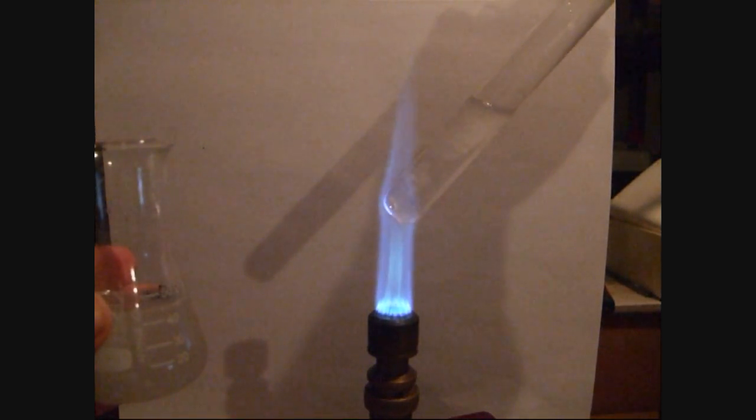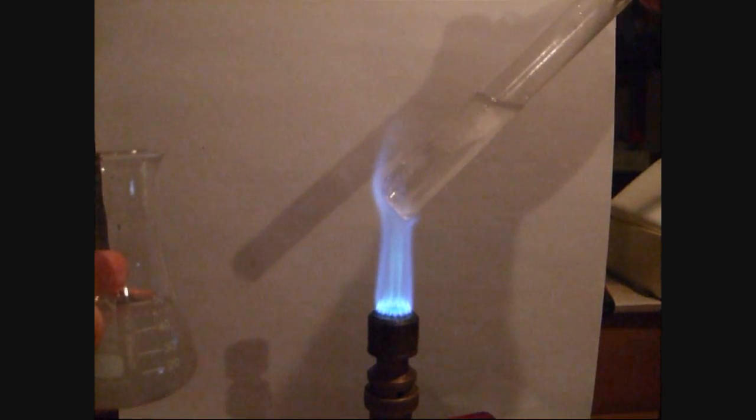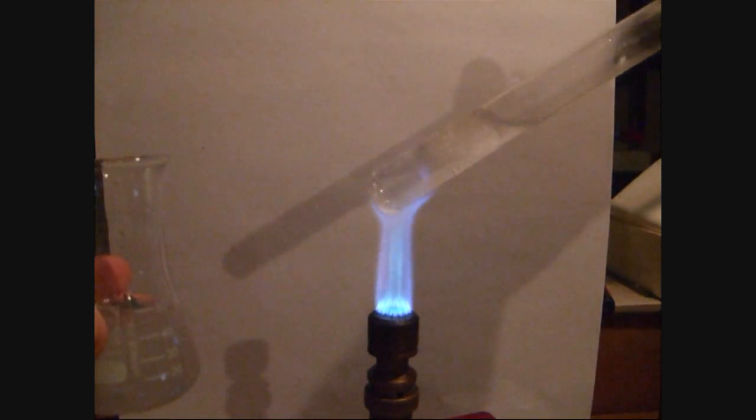Then the test tube is held into the flame and you can see the blue fluorescence on the surface of the test tube of the tin hydride-like compounds.